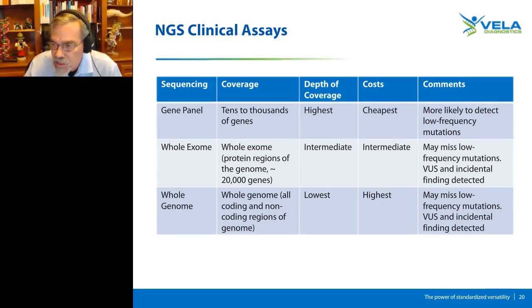DNA sequencing analysis is not always used as standalone diagnostics. It's actually part of a molecular toolbox that all of the labs need to develop. As NGS DNA sequencing of multi-gene panels becomes routine and standard for cancer samples, there must be an efficient and routine method for processing samples and for classifying variants. Determining which variants are biologically significant for cancer maintenance and development and which are not is not always easy, not even for the experts. Unfortunately, there are no agreed upon standards as to how to do this just yet. Much of the work usually falls onto the pathologist, who must advise the oncologist in recommending the test order, the amounts of tissue needed, and the budgets involved.